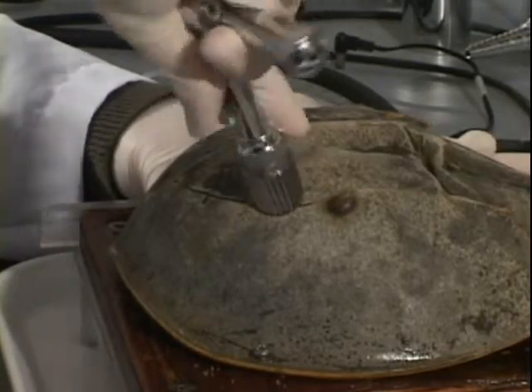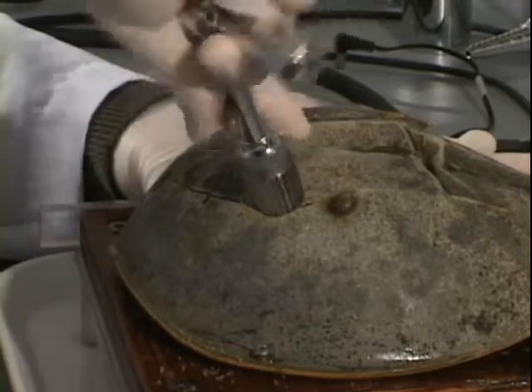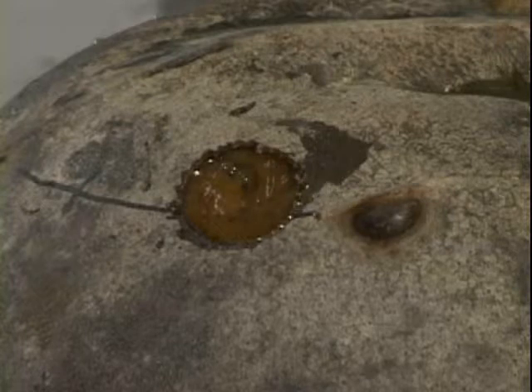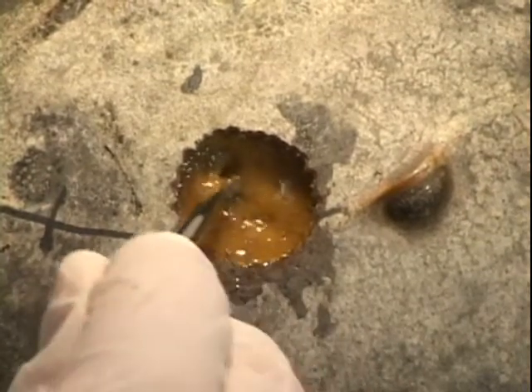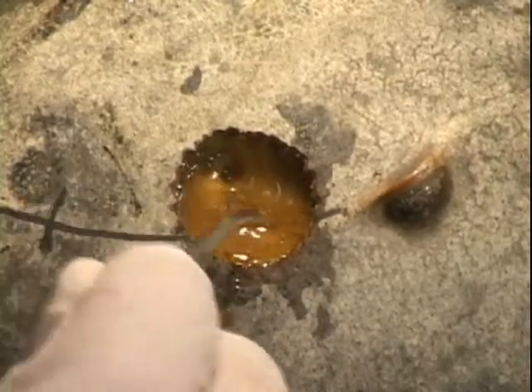A circular hole is then made in the carapace with a trafin. The hole is the same diameter as the chamber bottom. The center of the hole is located about 2 cm anterior to the lateral eye and slightly dorsal to the line so that the nerve runs along the ventral portion of the chamber. Overlying connective tissue is cleared until a full length of nerve is visible and the exposed nerve is freed from surrounding and underlying tissue.